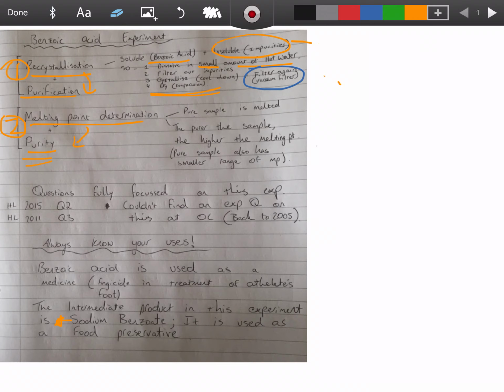When we have our melting point determination, the setup that we'd use in our lab in school is very simple. We've just got a metal block, which is a cylinder shape, and it's got a hole in it that would hold a thermometer, and another smaller hole that would hold a little glass tube.